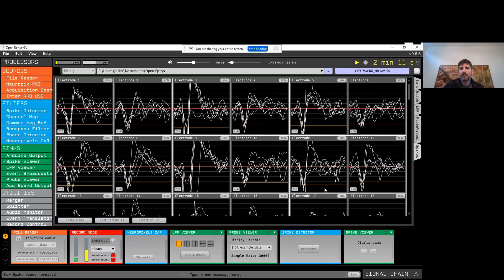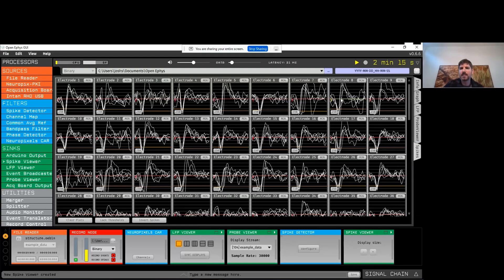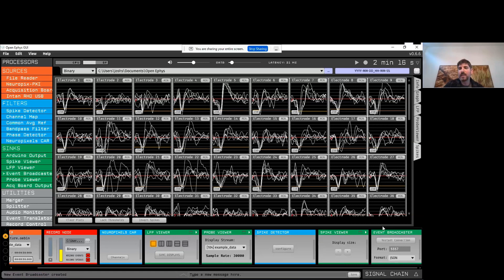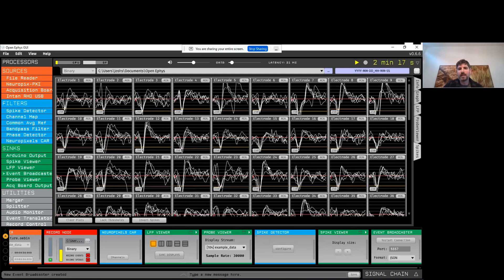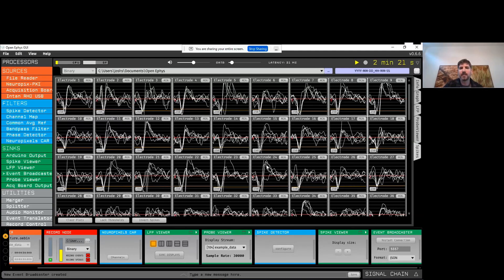We can scroll through a bunch of them or zoom out to view more simultaneously. The last thing I want to show is that there are a number of ways to get data out of OpenEphys software into other applications. One of the easiest ones for things like spikes is the event broadcaster — you can drop this into the signal chain and information about all these spikes will be available in whatever software you're using. You can use that for real-time decoding or custom visualizations in Python or MATLAB.